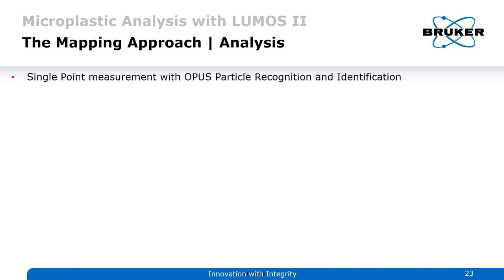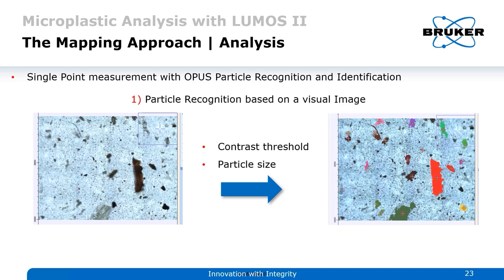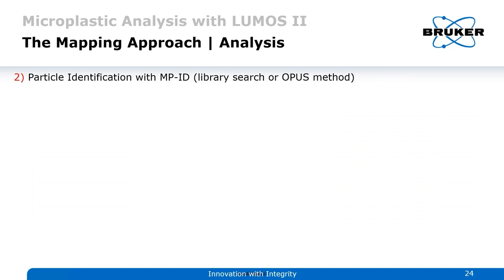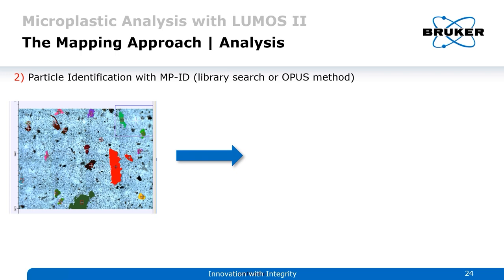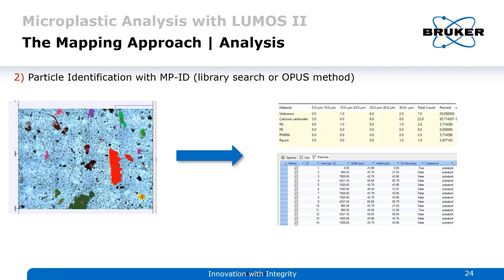When using the mapping approach, OPUS particle recognition finds all particles based on the visual image as a first step. We can set a contrast threshold to binarize the image and define a particle size range to look in. All individual particles fitting these criteria are identified and measured automatically. The second step is particle identification with the MPID functionality, which can be combined with library search or different OPUS methods, providing a list of particles, their identity, an overview of found particles, and statistical information.